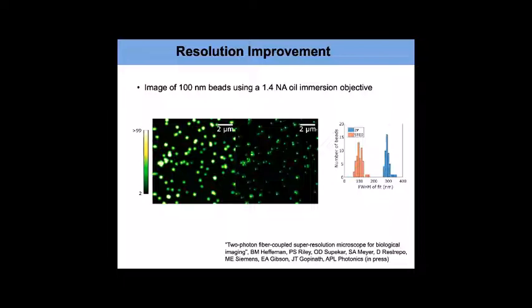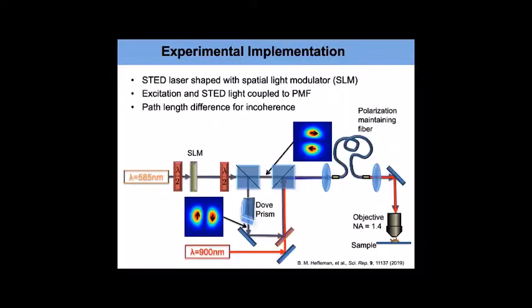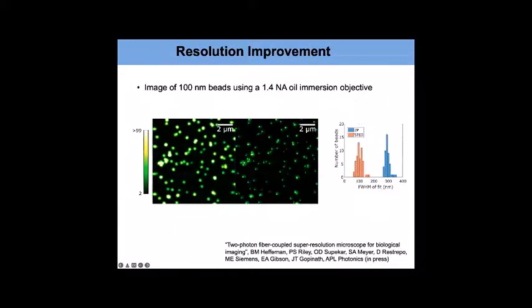Sorry, going back. These two modes were launched into the fiber along with a short pulse at 900 nanometers. After that, you can take the output of the fiber, focus it down, and perform STED with it, which is great.